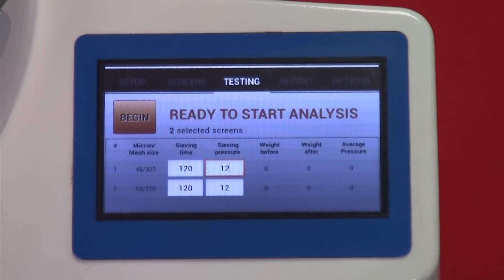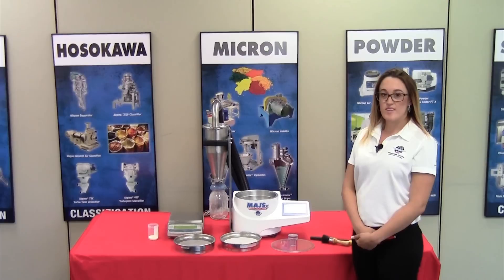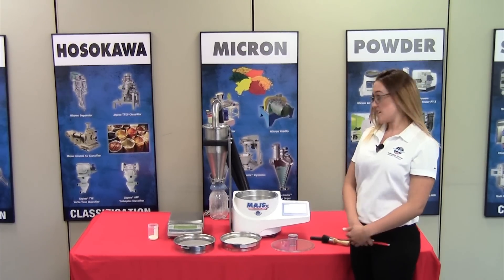Before pressing Begin on the testing page, review the different columns listed. The software lists sieve screens from finest to coarsest, because removing fines first eliminates cohesion and agglomeration that can skew results. Sieving time: we suggest 120 seconds, or two minutes, to allow powder to be evenly dispersed and for material finer than the sieve screen to fall through, while coarser material stays retained. Sieving pressure: we suggest 8 to 16 inches of water. For this test, we'll run at 12. Now press Begin to start the analysis.